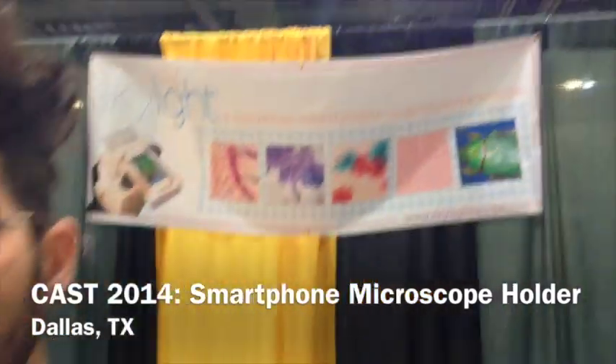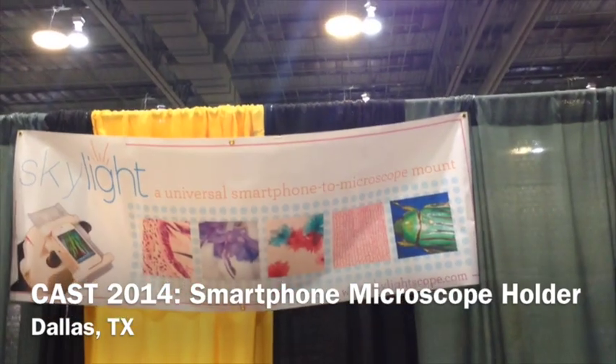We're talking with Andrew Miller. Hi, Andrew. Howdy. Andrew is with Skylight, a universal smartphone-to-microscope mount, right? That's exactly right. Okay, so tell us, Andrew, how this works. By the way, you are the inventor, the creator, the CEO, the chief bottle washer of this organization.